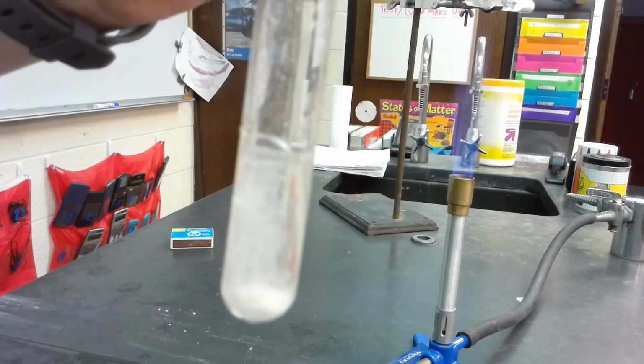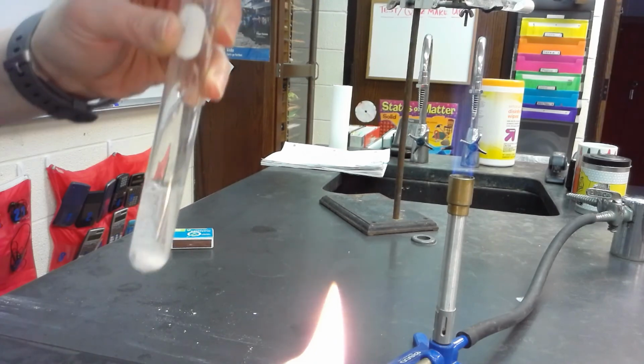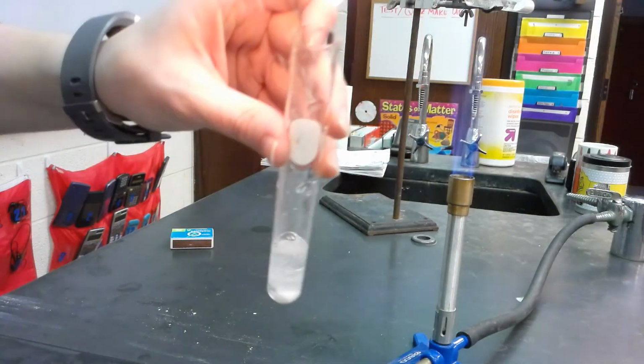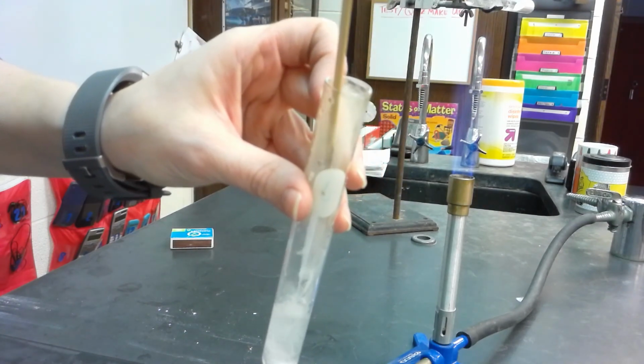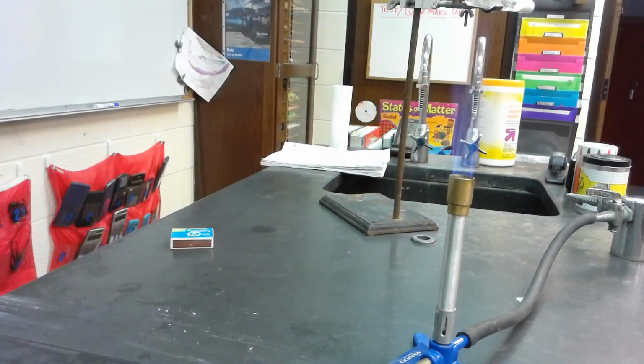All right, let's see if that's been enough. So we're going to light our splint. Okay, we've got our splint going, and we're going to take the note card off and put the stick inside. And what did we see? The fire definitely went out. So just like with our earlier reaction that we did, that is an indication that carbon dioxide is being produced.